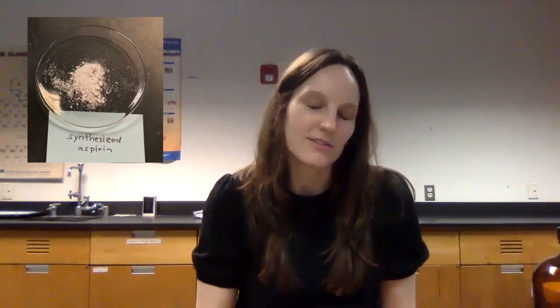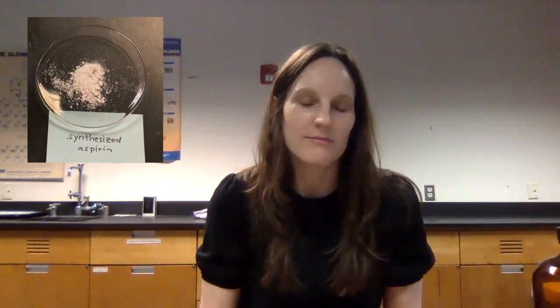So that's it for the lab. I think that the synthesis went well. I think my aspirin looked like fresh aspirin when I took it out of the vacuum. So that's great. And if you're ever in a similar situation, like in a lab or at work or in life where something's not working out, it might just be bad luck. So I could come in here tomorrow and maybe the TLC would work, and you just never really know why.